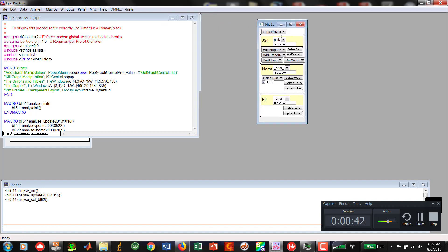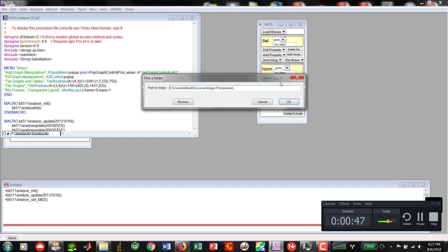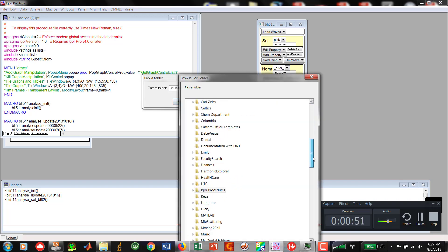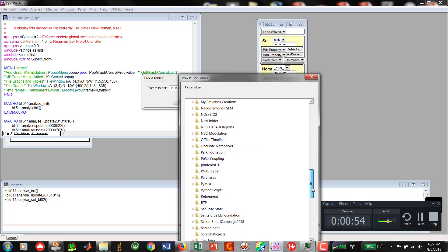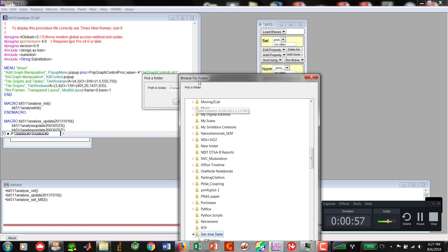You guys are familiar with that. Then we're going into load waves, going down to spec dat scan. We're going to go in and browse.